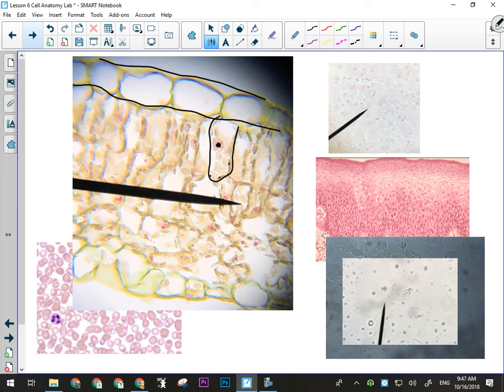If you look closely at the bottom of the nucleus right here, you can see it's slightly different than the top of the nucleus. That's because that's the rough ER. I'm not saying use your imagination when you're looking at this, but use your imagination a little bit when you're looking at this. You can see quite a bit of stuff.